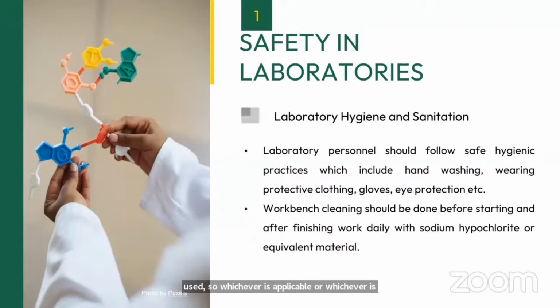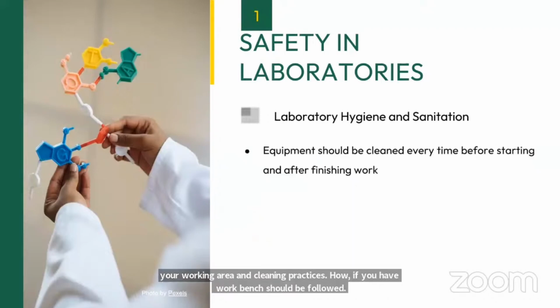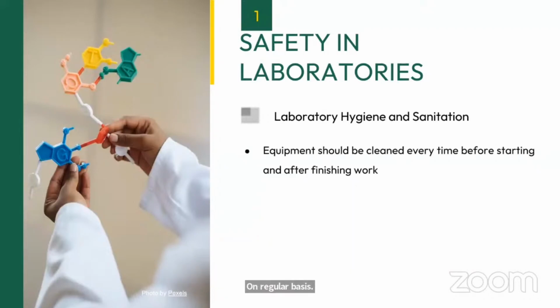Not every place hypochlorite will be suitable, and not every place alcohol will be suitable. So you should see which is appropriate for your working area, and cleaning practices of your workbench should be followed on a regular basis. Equipment should be cleaned every time before starting and after finishing work.